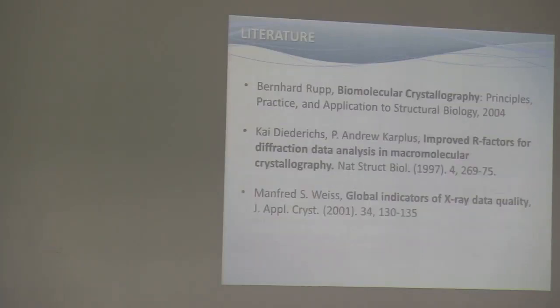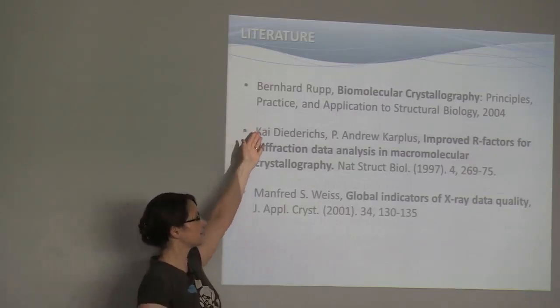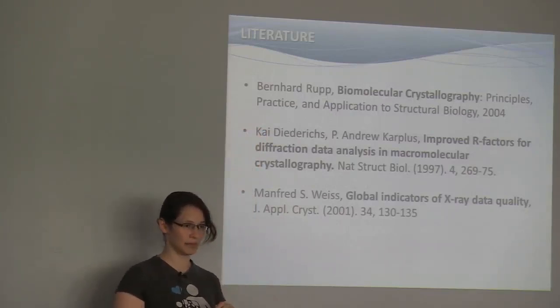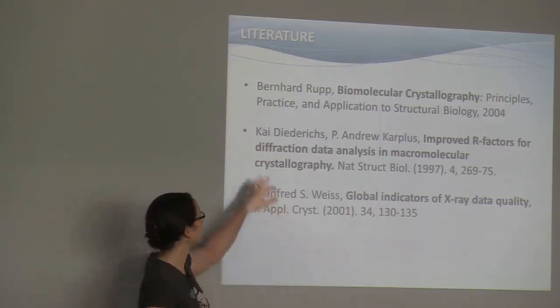Here's some literature. Bernhard Rupp's book gives an excellent overview on the different aspects of experimental phasing. Also, the example I'm using in the tutorial is actually the same example that's used in the book. So you could actually go through the 10 pages or so there.